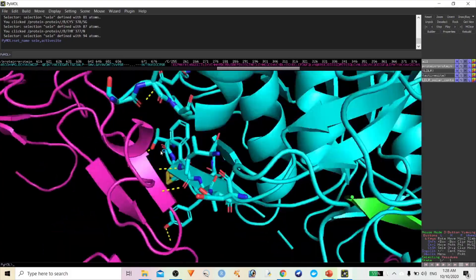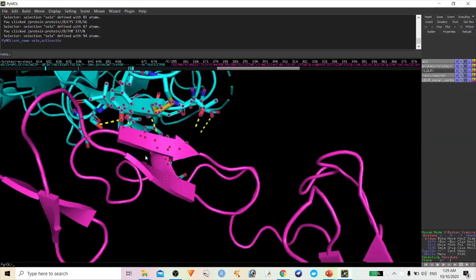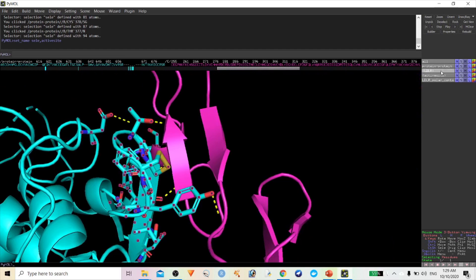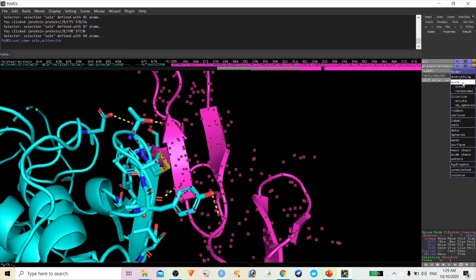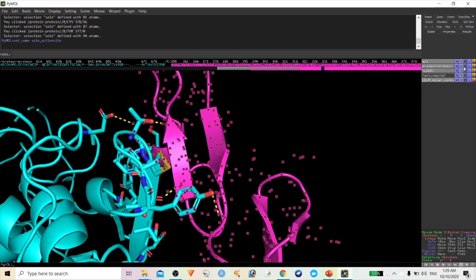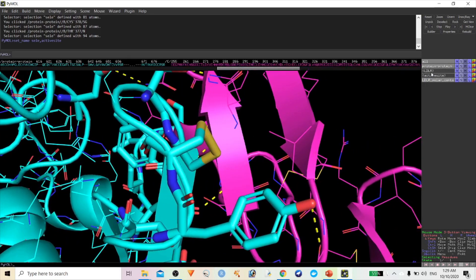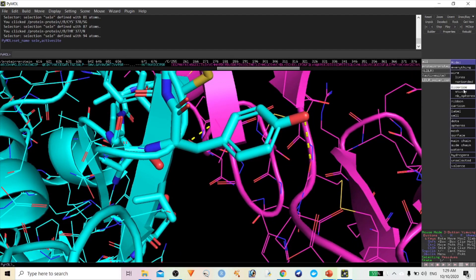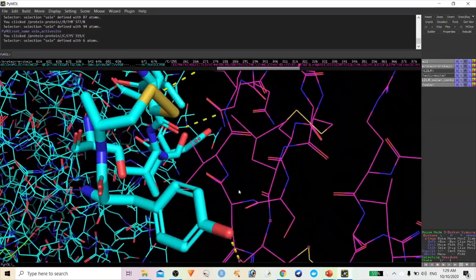If you want to see the interacting amino acids clearly, type 'select ldlr, show lines'. Once you click Lines, it will display in lines format. You can also hide the cartoon for clearer visualization. Now the isolation is very clear — you can see the amino acids interacting with this one.